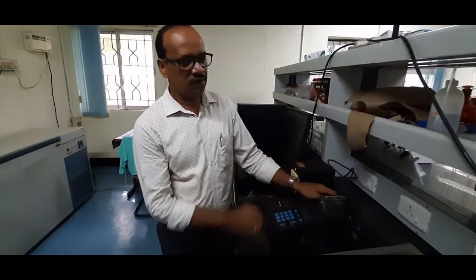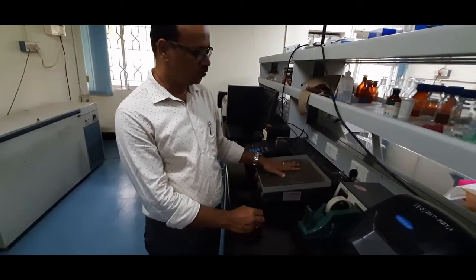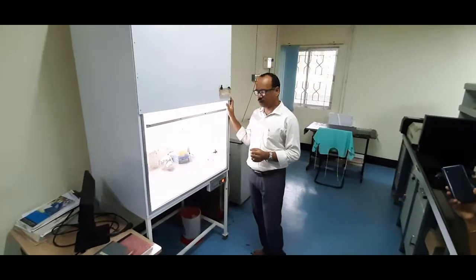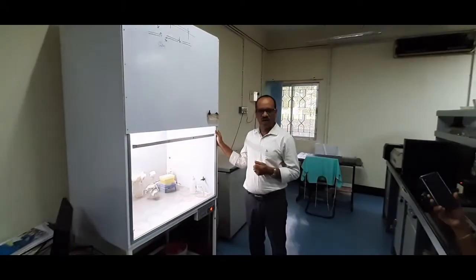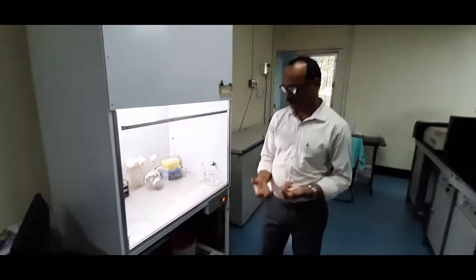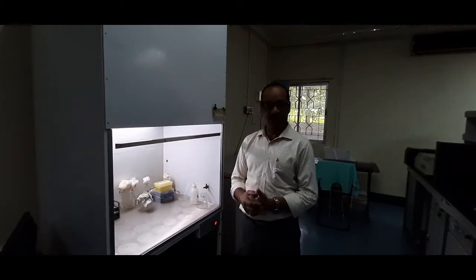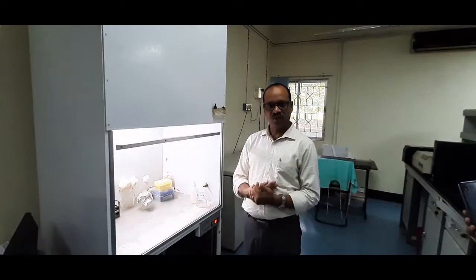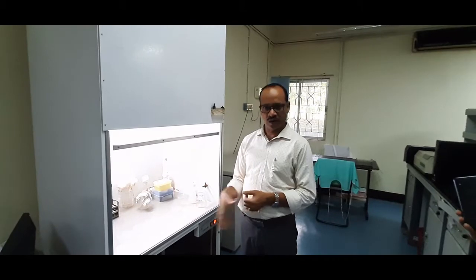This is a rocker system where samples are kept on the platform and it rocks gently for gentle mixing. In a molecular biology lab, we also have a laminar flow hood. For example, when handling pathogenic or contagious organisms, you should have this safety cabinet. Just as you use a laminar flow hood in the microbiology lab, the same applies here. Bacterial transfer and culture transfers are all done inside the laminar flow hood, after which the samples are taken to the microcentrifuge for separation.